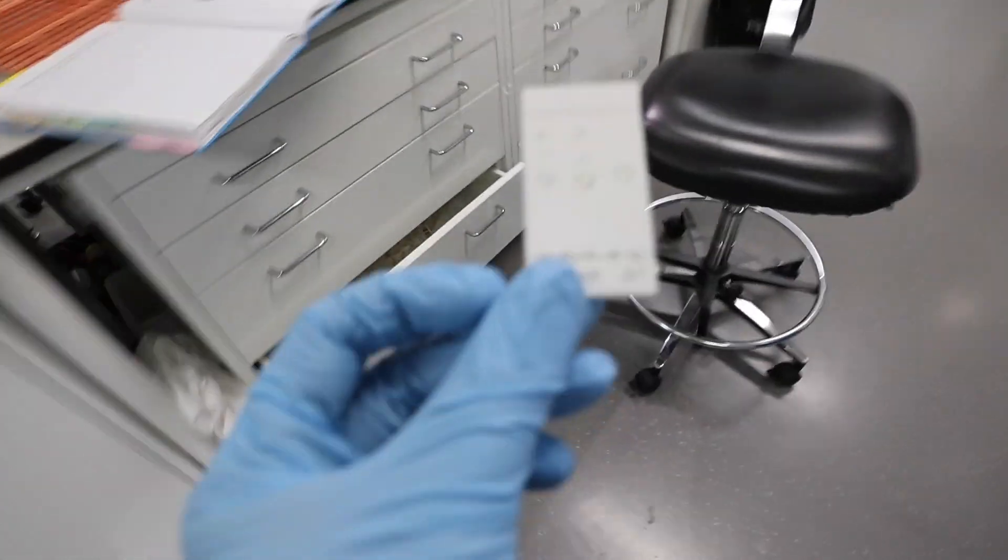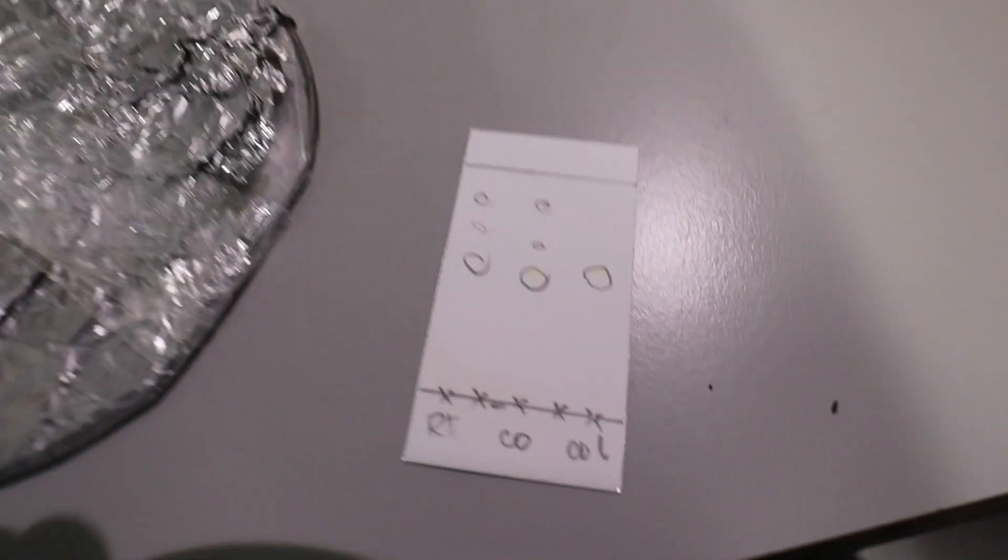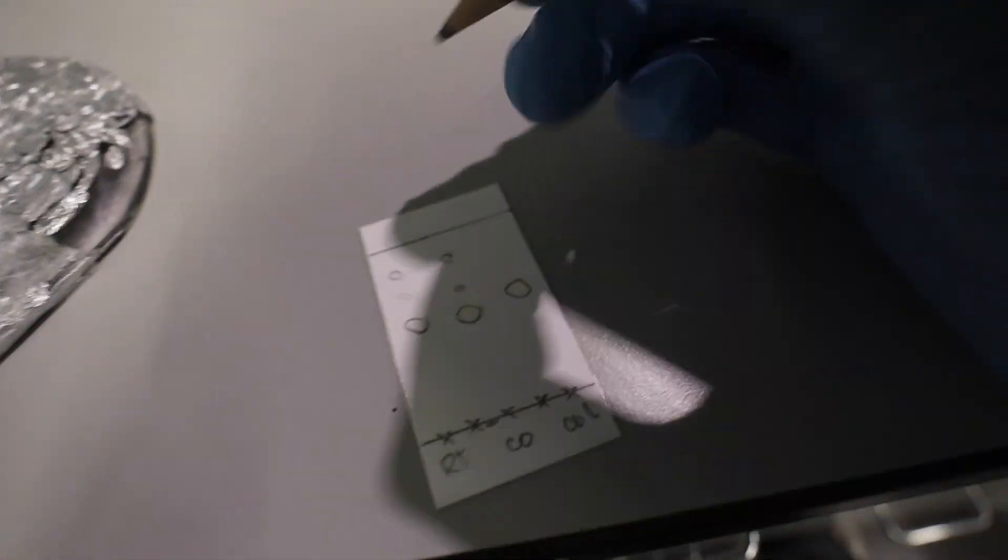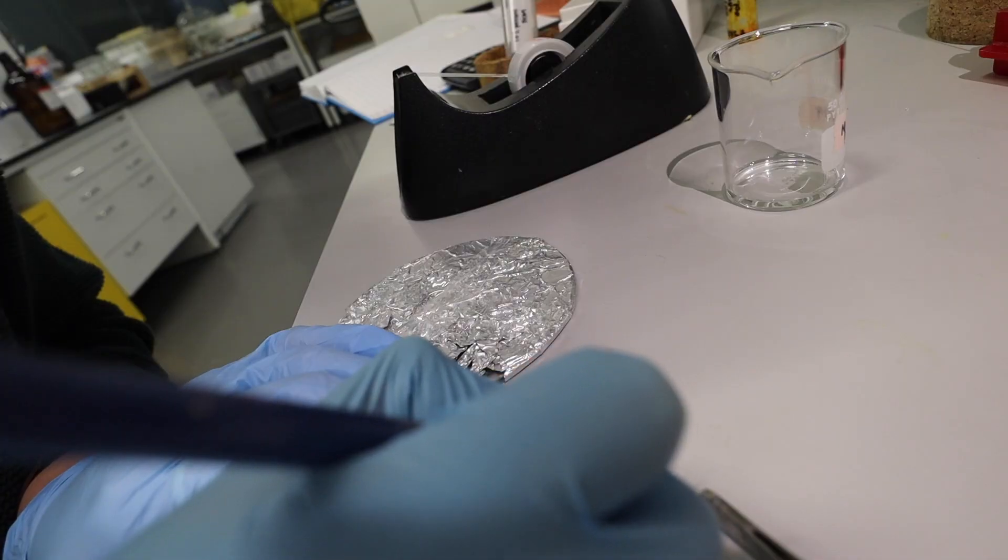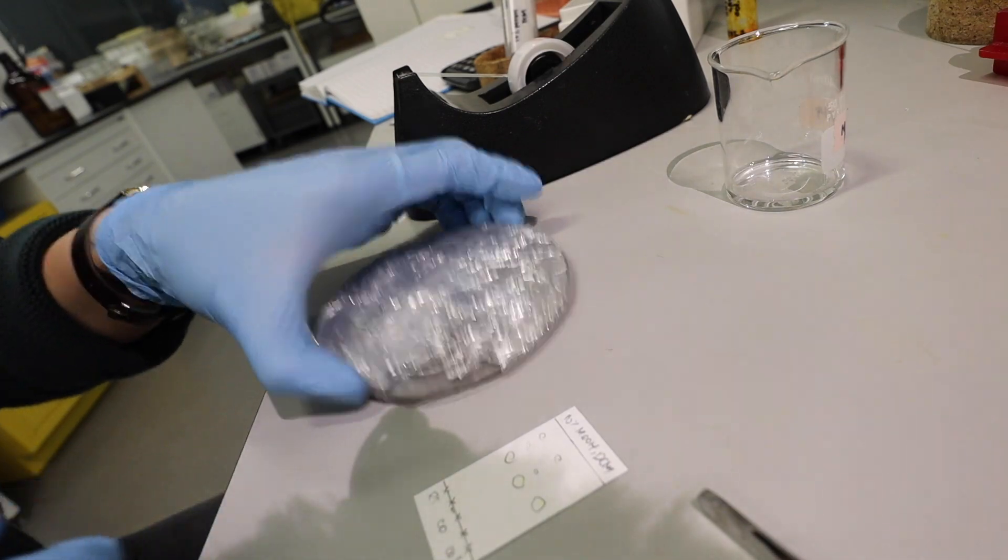I just see one spot for my columned compound. The reference has like this unreacted drug and something else. So yay, we got the compound. So I usually just draw or kind of outline the spots so that I can put it to my notebook. All right. Done.